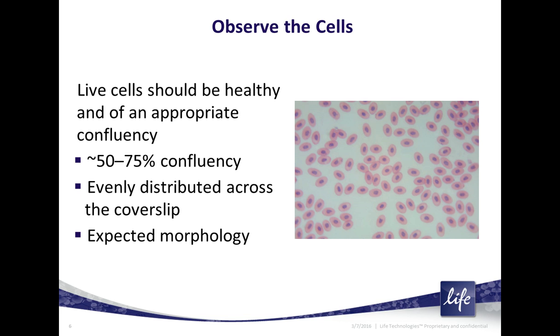For non-adherent cells, you'll want to take a look at those as well. Now, morphology is a little harder because they're usually just rounded up balls. But the staining steps that I'm talking about in this protocol can be done. You just have to do washes and centrifugations in between each step, or adhere them to a substrate, such as using poly-L-lysine or a cytospin device.